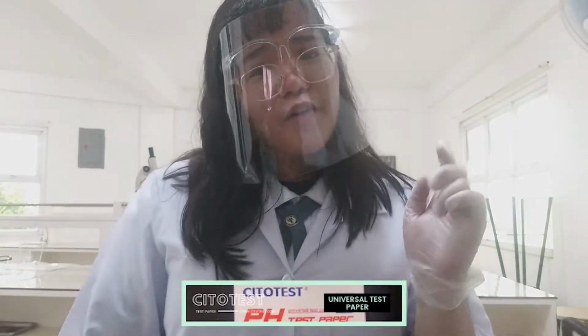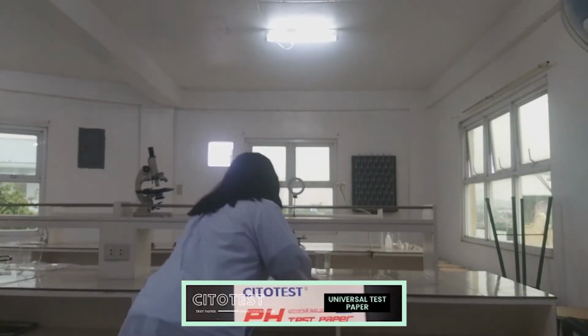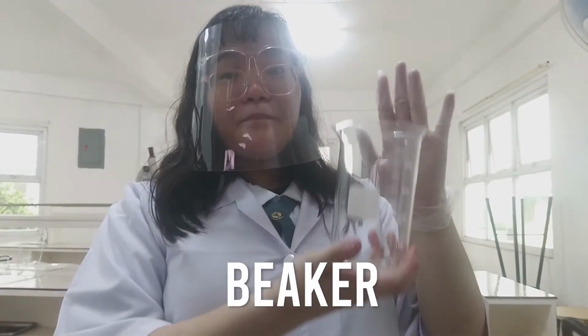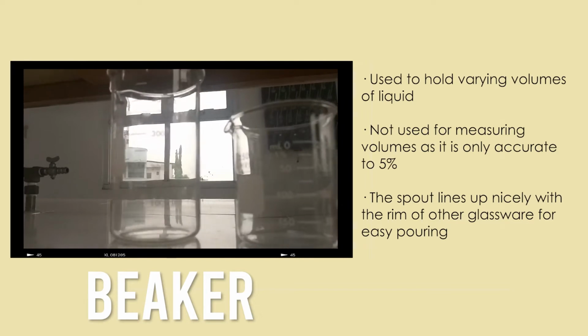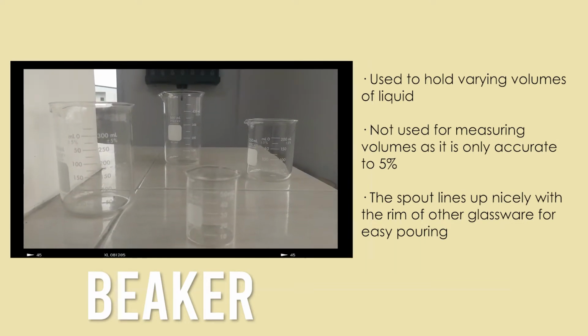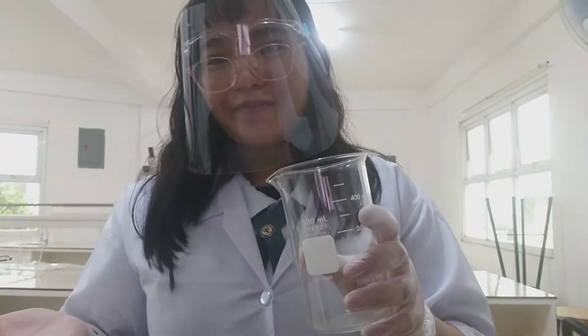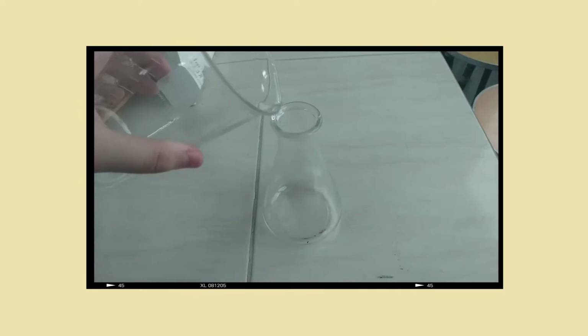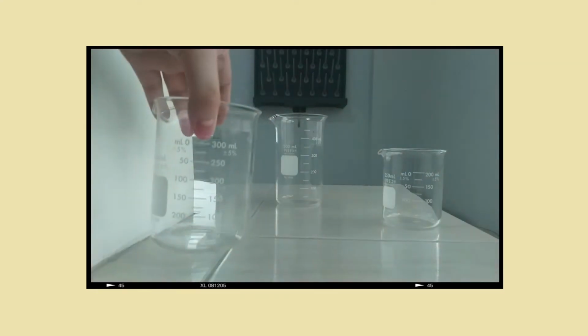Next, I think we are familiar with this one. This equipment won't be famous if it is not frequently used, right? And it is called the beaker. Beaker holds a variety of liquids, and it has a teeny bit special thing about it, and that is the spout lines. These spout lines are used for easy pouring and less spillage from one container to another. The Erlenmeyer flask and the beaker are not used for measurement as they are not reliable and only accurate to 5%.